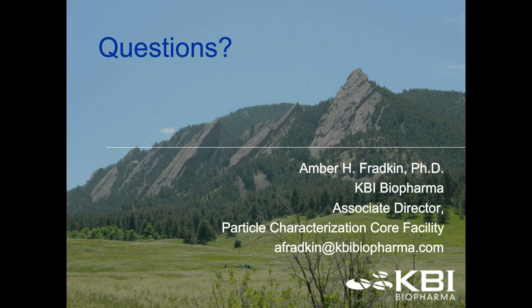I recommend as early as possible. The more data you have up front, the more it can help you as you start to progress toward that clinical and even commercial phase, especially with things like formulation development that can really help you understand stability, as well as if your formulation is the correct formulation.